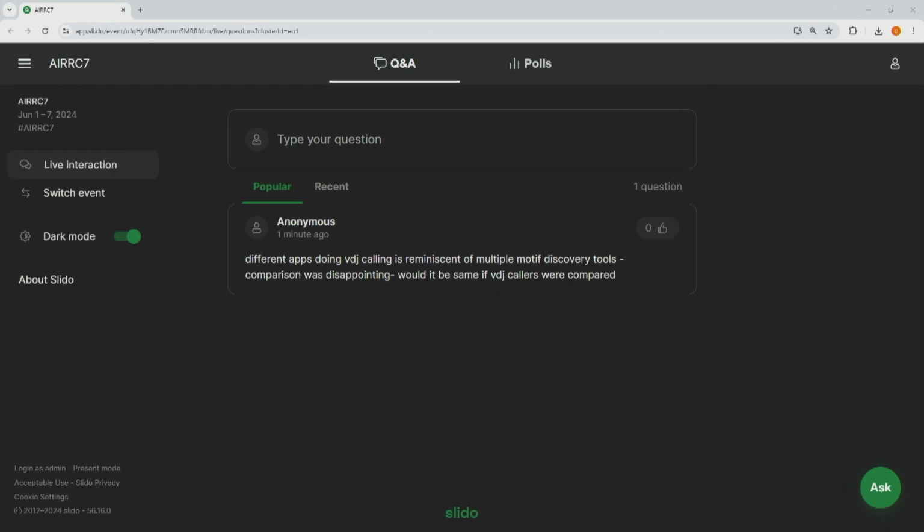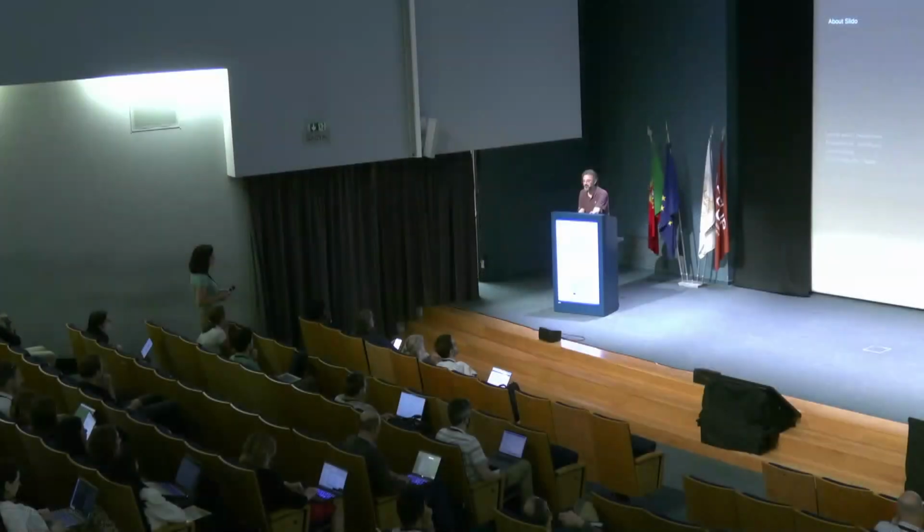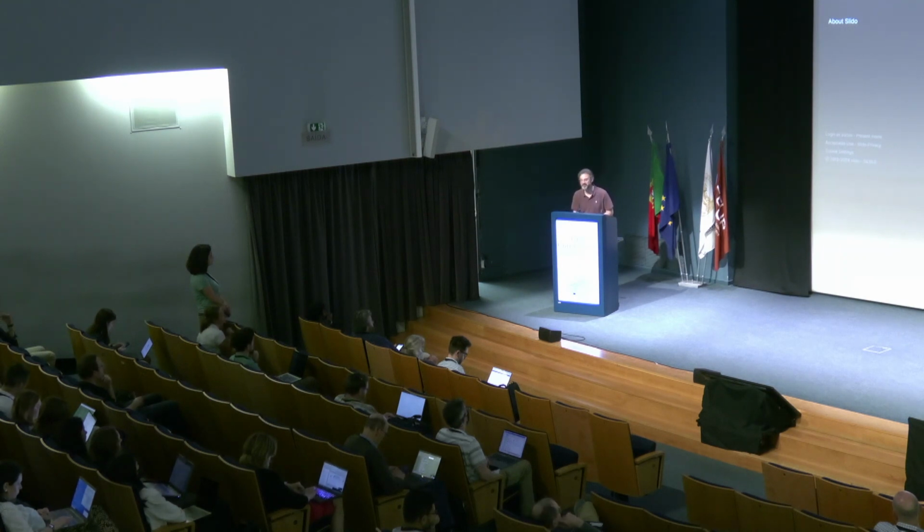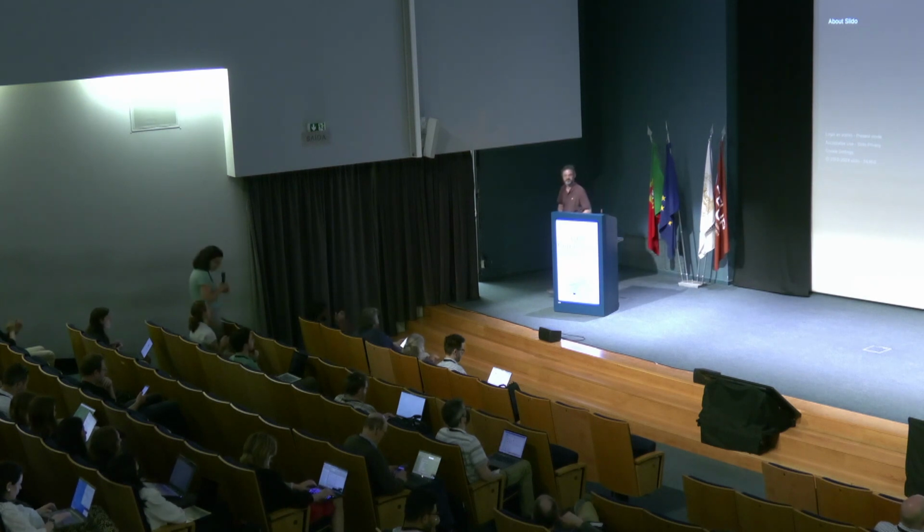So there have been, I think, a couple of publications. VDJ callers, I assume, are things like IMGT/V-QUEST or partis or MiXCR and things like that. There are some good benchmarking works out there, so there are clearly differences between those VDJ callers. I think Goriari has a recent either preprint or publication that's going over some of that. So yes, there are differences, and I think you should talk to him if you want to know the latest on the benchmarking. Okay, thank you, Steve.